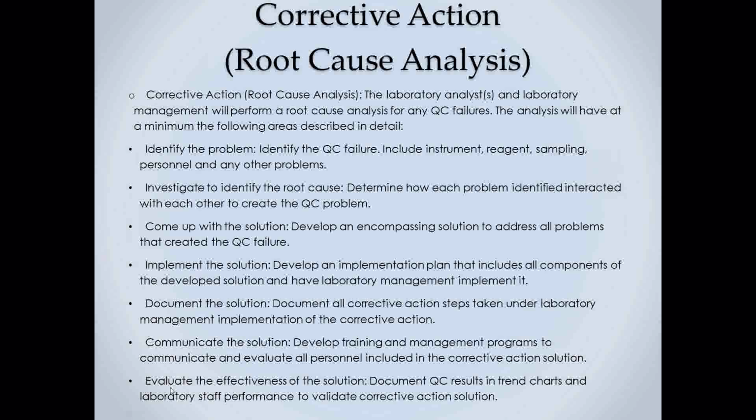So you have to perform a root cause analysis if a QC step fails, which is good anyway, because number one, you correct it so it doesn't happen again. You validate your data for robustness. You validate the method for robustness. You validate the training and your personnel for robust behavior. And you can show that to your auditor when they come in.